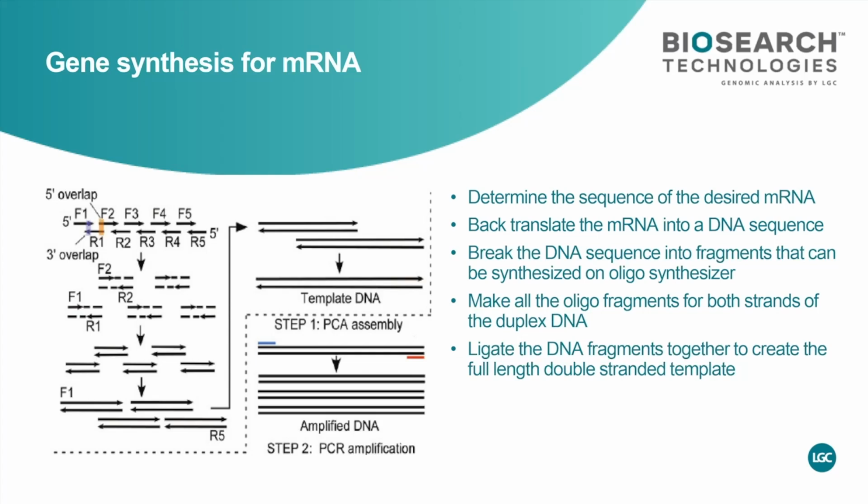As you can see, they overlap. So what you do, you put a 5' phosphate on each oligo. And then when you put them together, you add ligase. What it does, it actually puts longer pieces together until you have a full length gene assembled, or a template in this situation. Then you can amplify it, clone it, and find the perfect clone for your target.